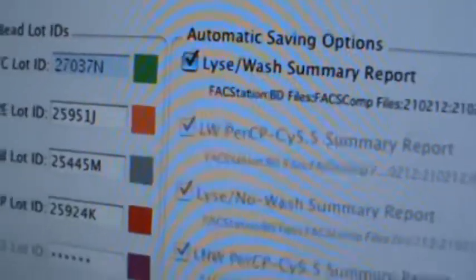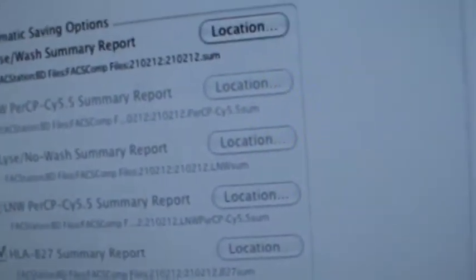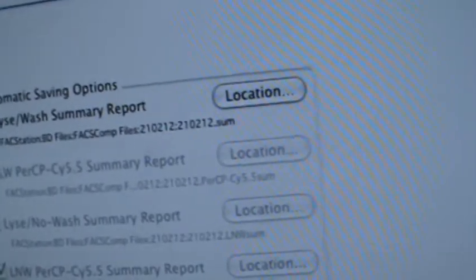Okay. So for instance, if you were grabbing Stacy's, his lot numbers are different. So you would need to put those lot numbers in the system. So you start with your unlabeled. Unlabeled PE lot, 50 lot.